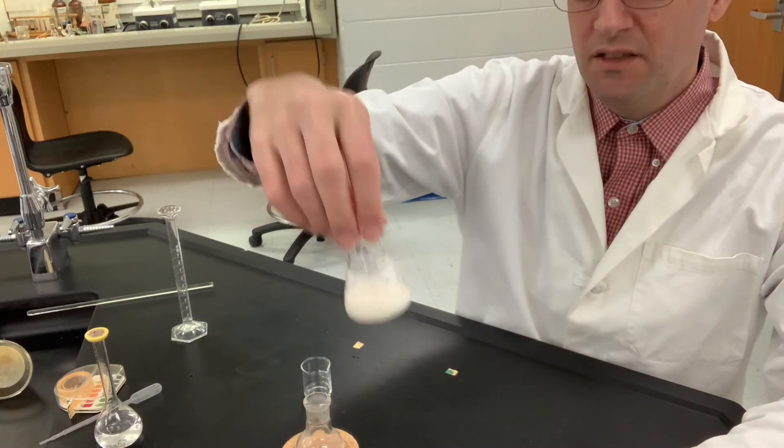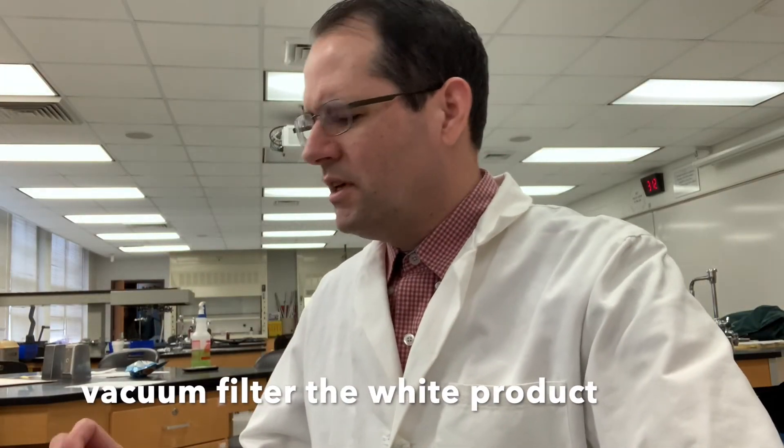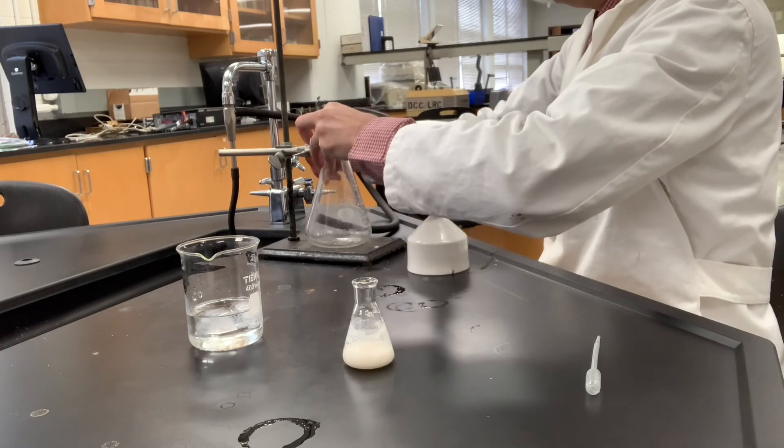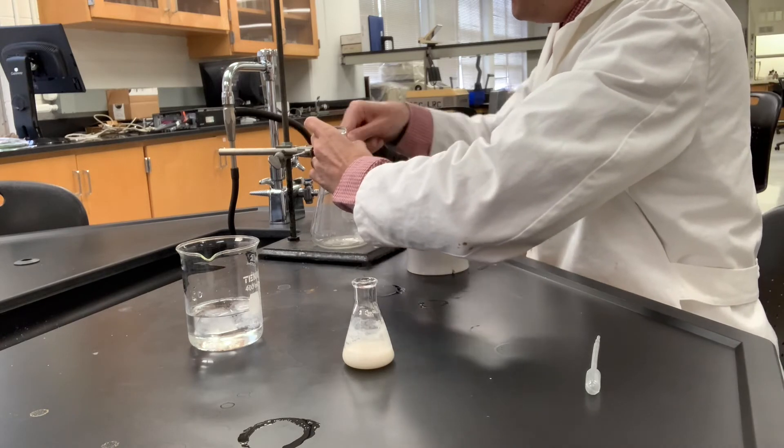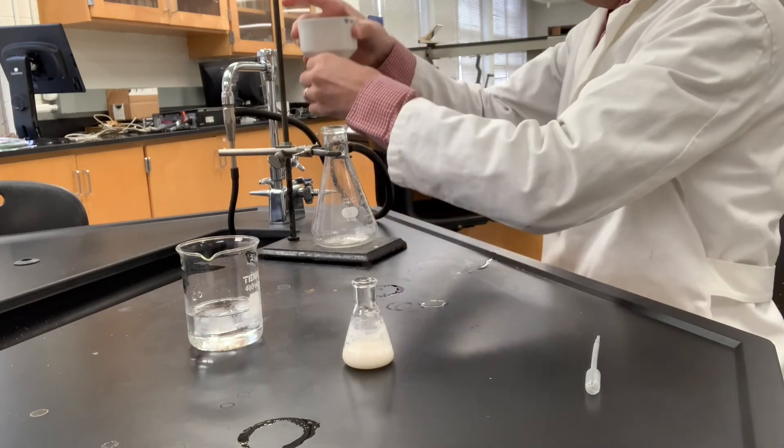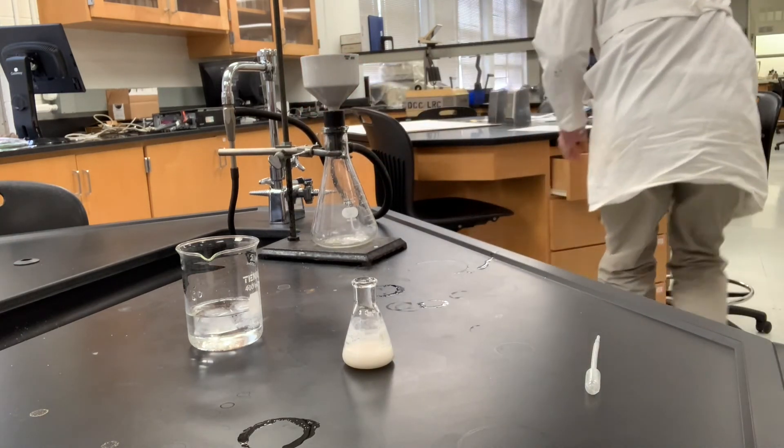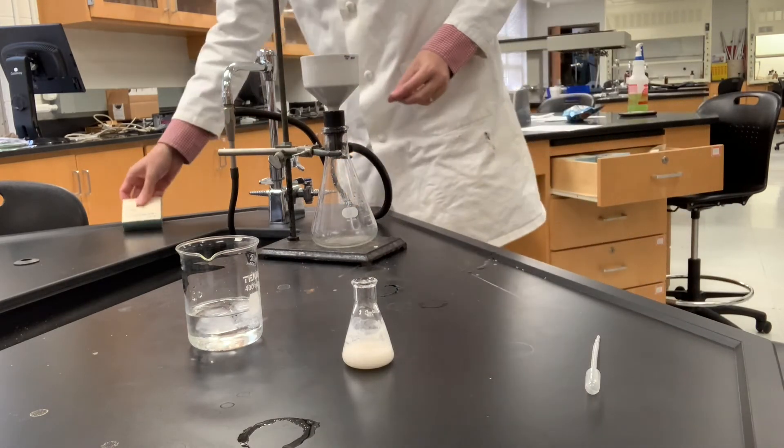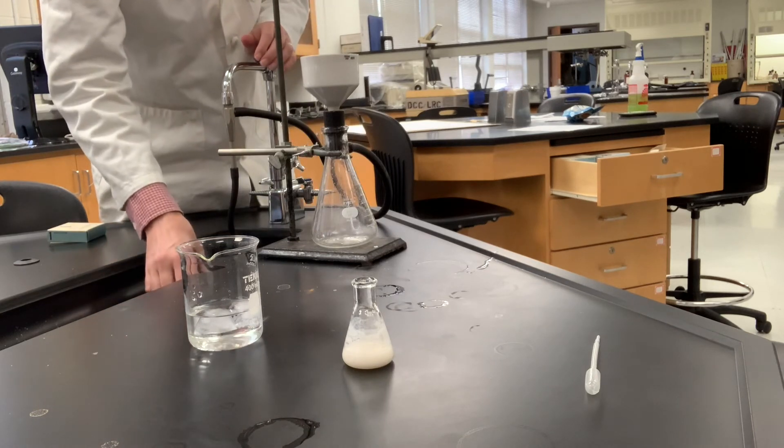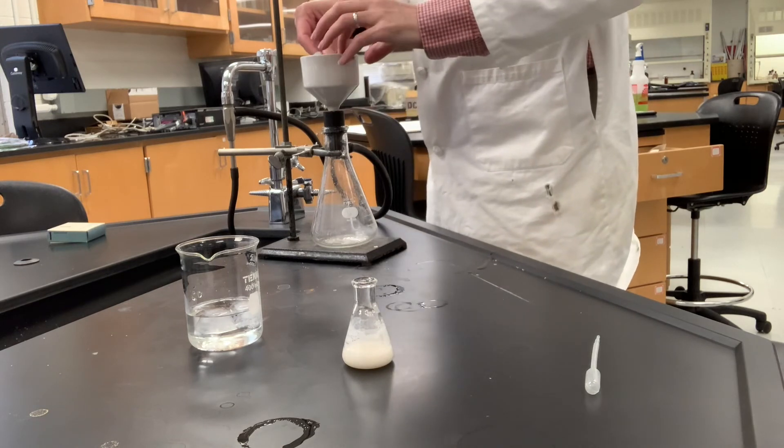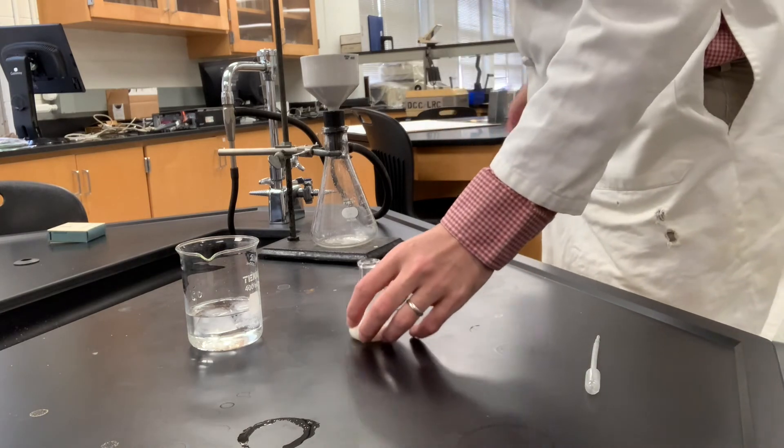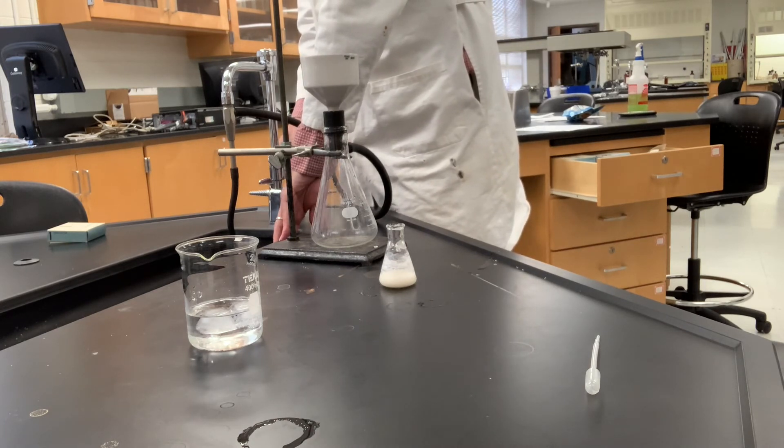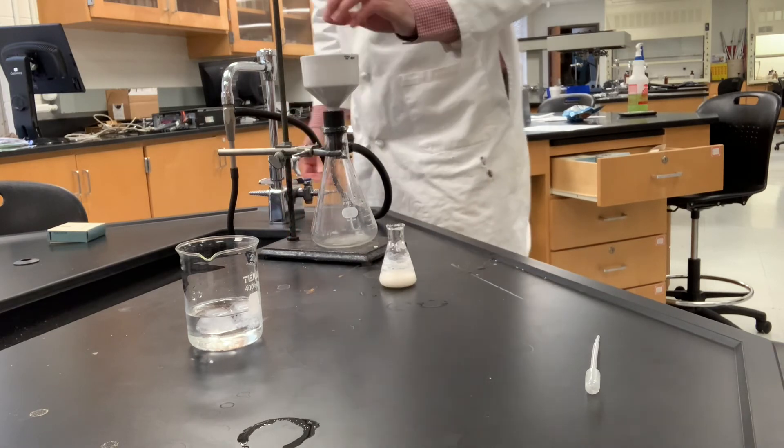In this step we want to do the vacuum filtration on the product. I'm here at the filtration station. I've got a sidearm flask here that I will fix with a clamp. I'll put the vacuum sidearm on the tubing, put our Buchner funnel in there nice and snug. Once again we'll use the qualitative filter papers. Because this reaction is being carried out in aqueous solvent, we're just going to go ahead and wet our filter paper with water. It's near the end of the day and it'll take overnight to dry anyway. We'll get this started. Turning on the water aspirator activates the vacuum. That should be aspirating.